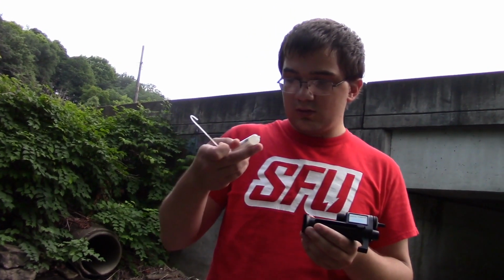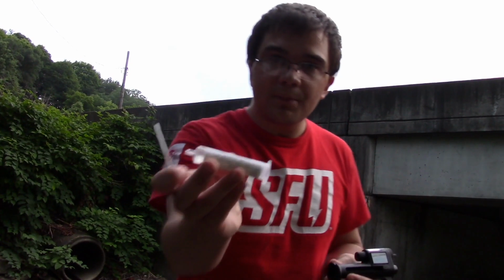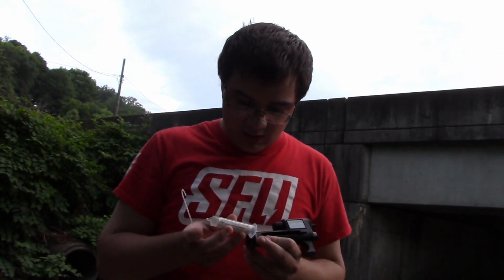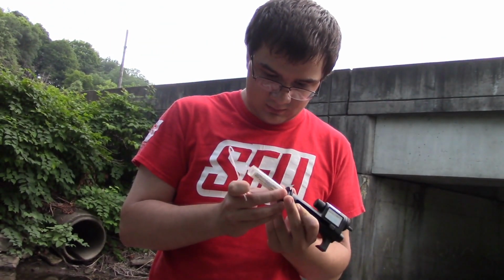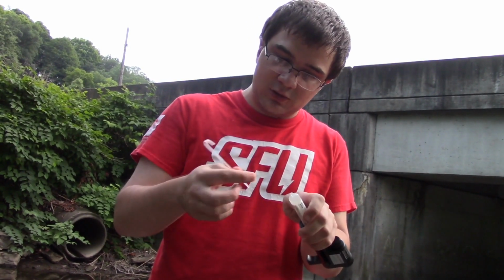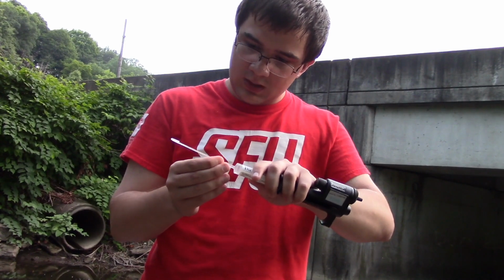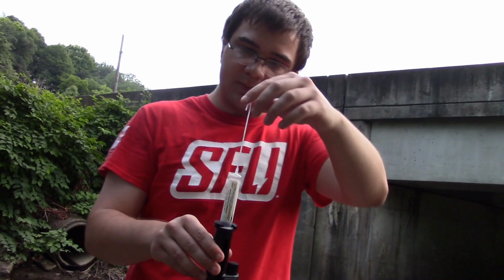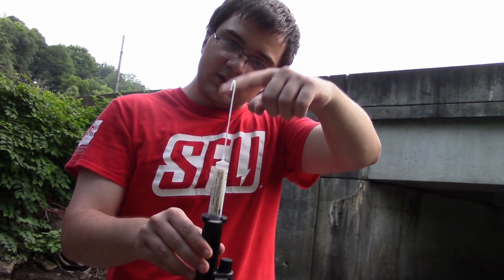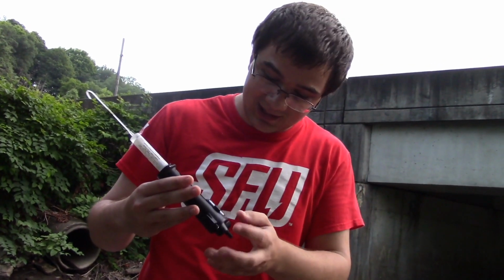So the first thing I'm going to do is, since I'm using a 100 milliliter sample, I'm going to take this 1.6 normal sulfuric acid cartridge and insert it into the digital titrator. And then I'm going to put in this dispenser tube. Now I'm going to turn it so it's facing up this way, and you always want it facing up since it has this hook at the end. It's hooked downward. If you hold it down like this, it's not going to spray up in your face. So you really don't want that.